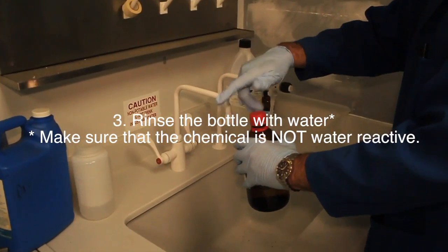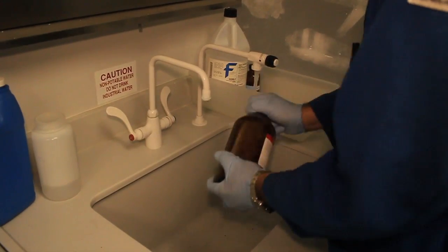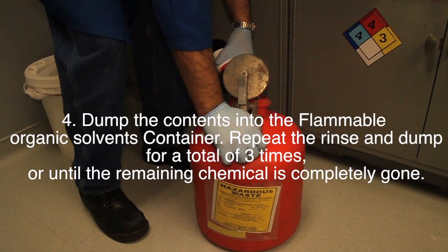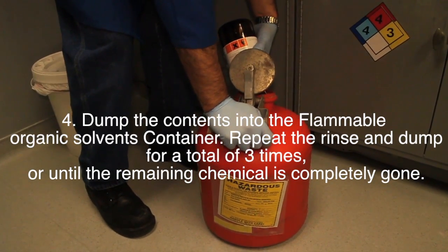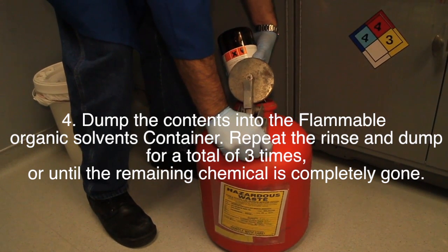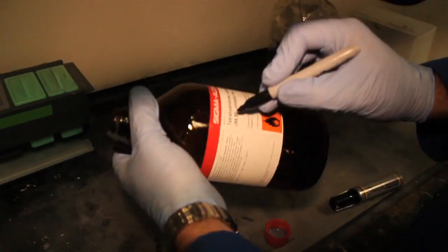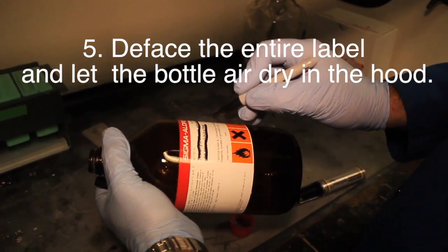Third, rinse the empty chemical bottle with water. Please note to make sure that the chemical is not a water-reactive chemical. Dump the contents into the flammable organic solvents waste container. Repeat the rinse and dump process for a total of three times, or until the remaining chemical is completely gone.